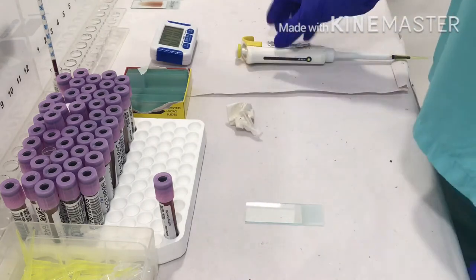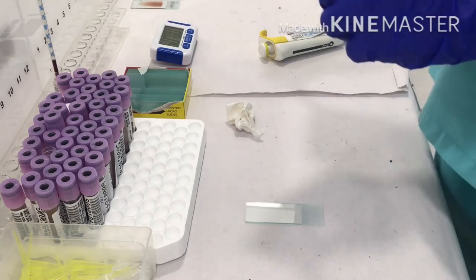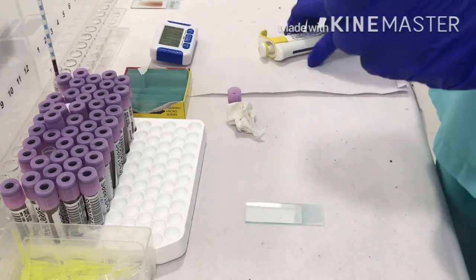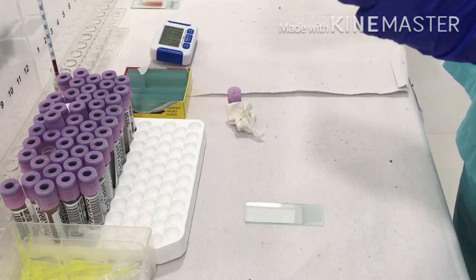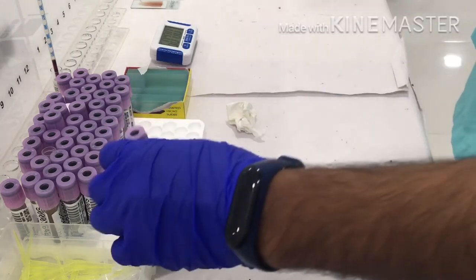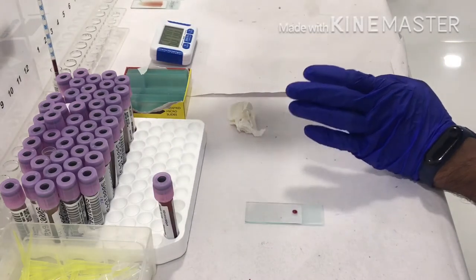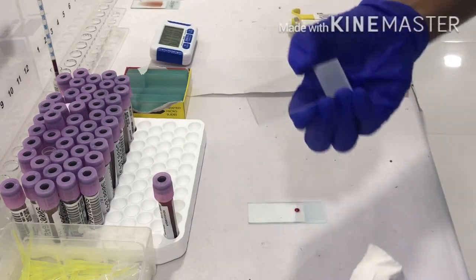And also here we are going to make a smear. Whenever we make a smear, we should have a grease free, clean, frosted slide. We have to take approximately 5 microliters of blood, a drop of blood, to make a smear. So I put a drop of blood over the slide.